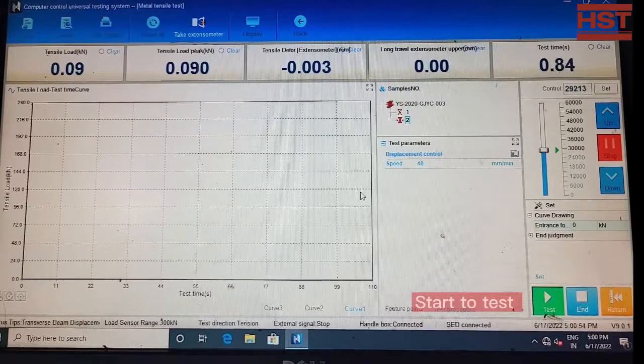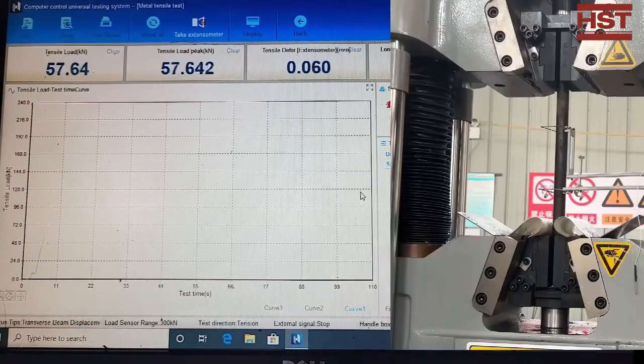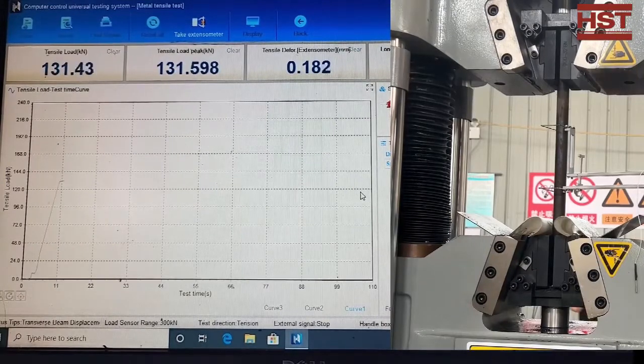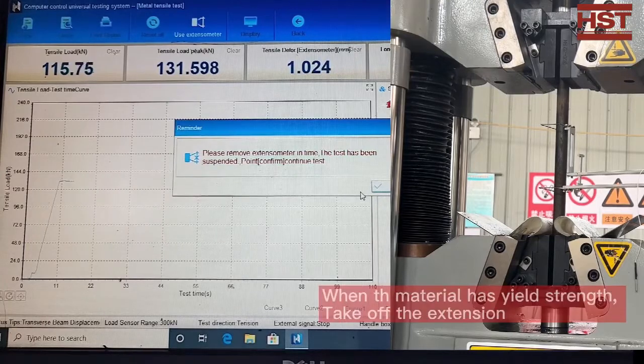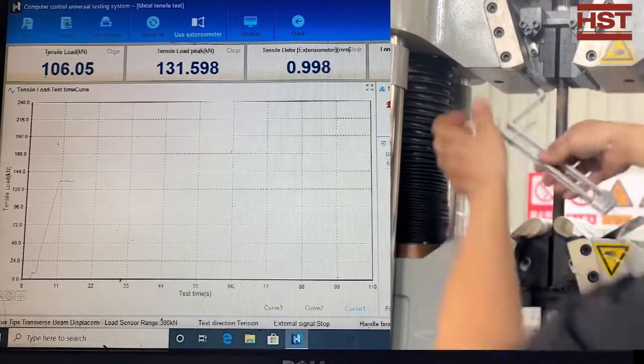Then you can start the test. As you can see, as the tensile load gets higher, the curve is steadily getting higher as well. When the material reaches the yield strength point, you will get a notification from the software. Then you can take off the extensometer.